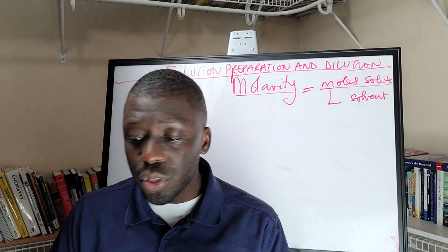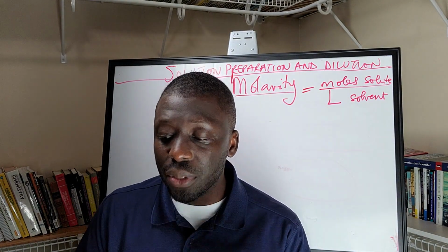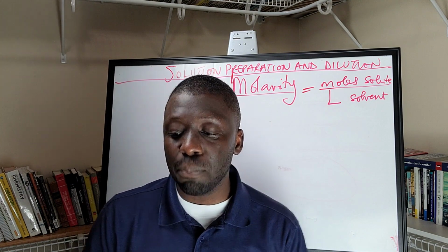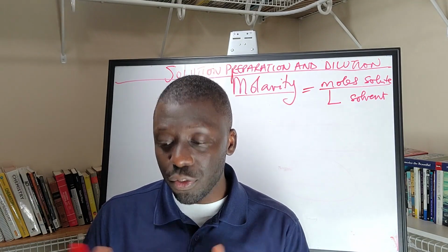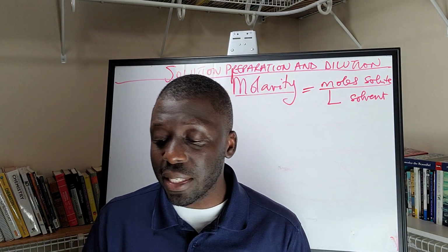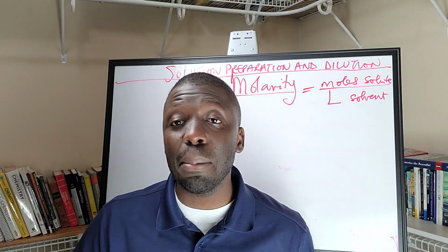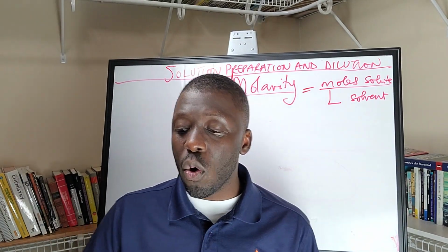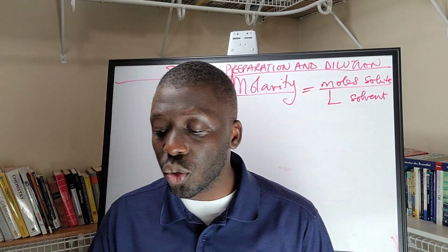We will be using Kool-Aid powder to show you how this is done. You would have the tool, which you should have reviewed. You'll be looking at a volumetric flask and knowing how to work with it. That's part of what you'll be doing in lab. I want to focus more on the formula and how these calculations work.